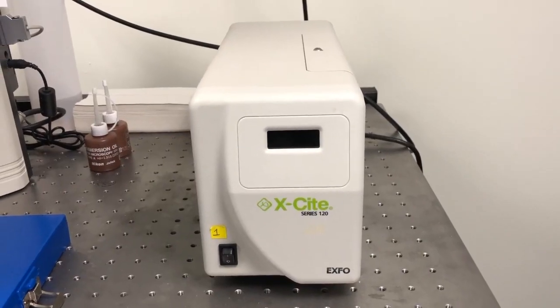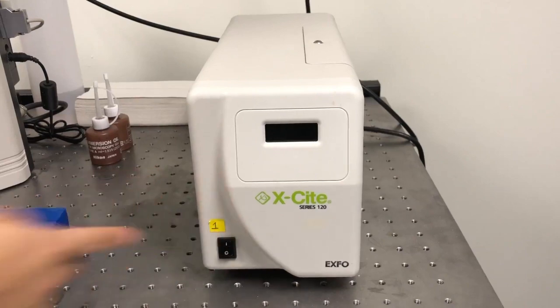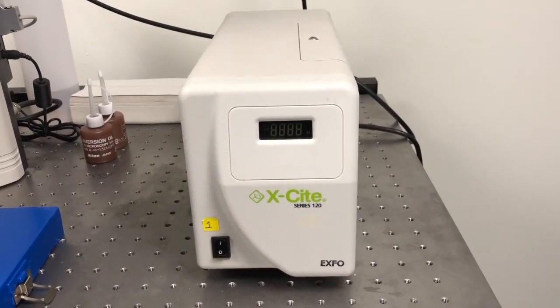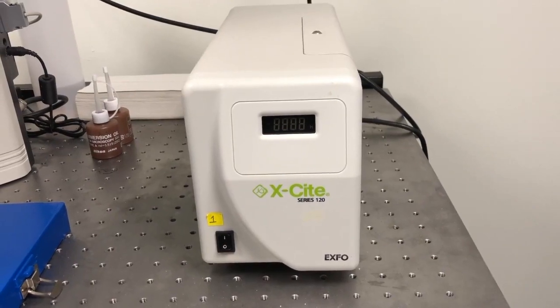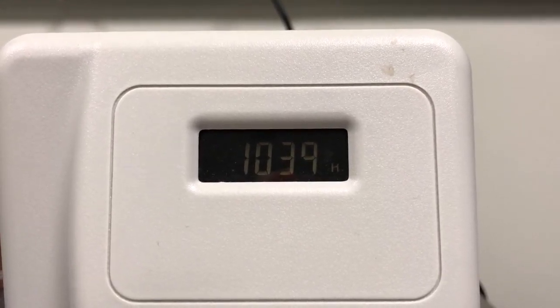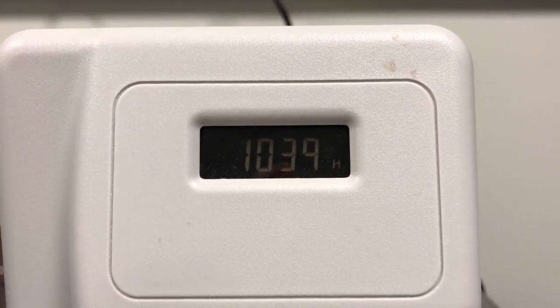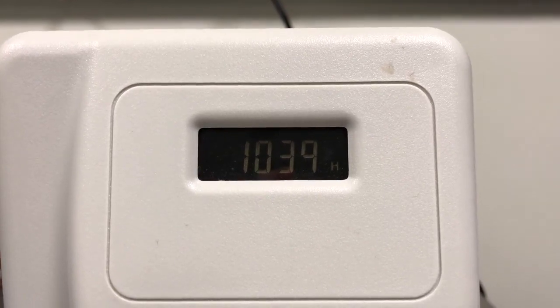In order to turn on the Nikon 80i, follow the instructions 1 through 5 taped on the instrumentation. First, turn on the excite box, which is the fluorescent excitation light source located on the right-hand side of the microscope. The box should show the number of hours that the lamp has been on. The maximum is 2,000 hours. If it displays cool, the bulb is too hot to turn back on. Wait 15 minutes, then turn on the excite box again.